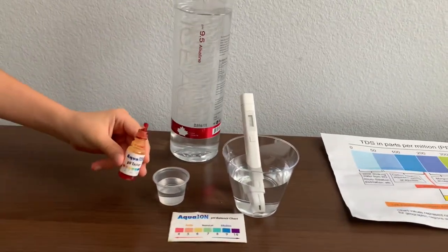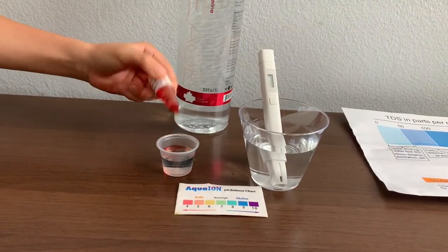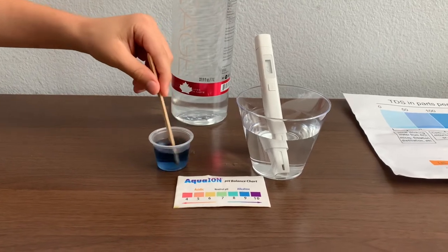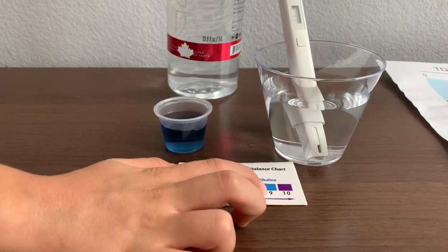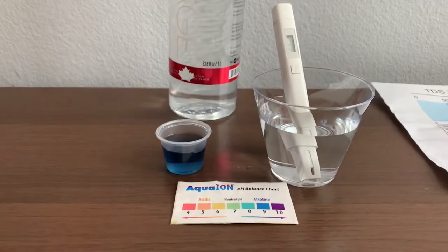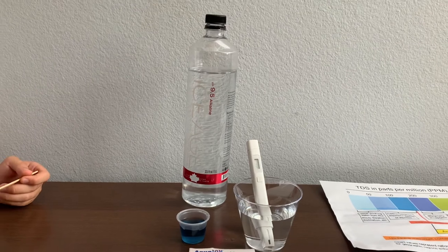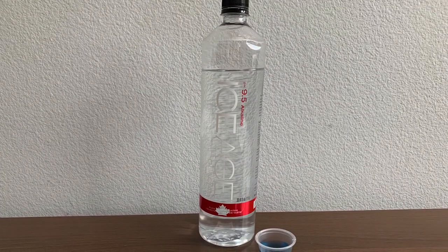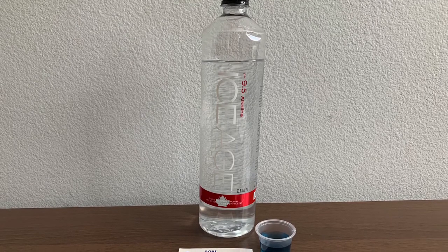Now let's test the pH level. Only do two drops. Let's swirl for a better result. I give this a 9.5 — this is alkaline water.